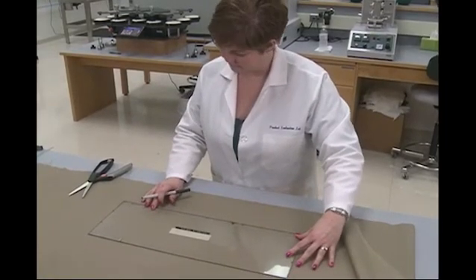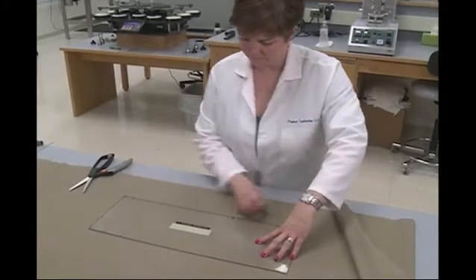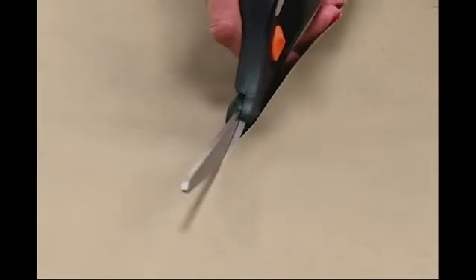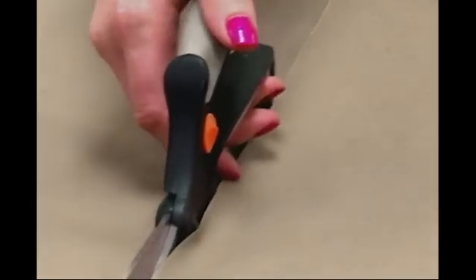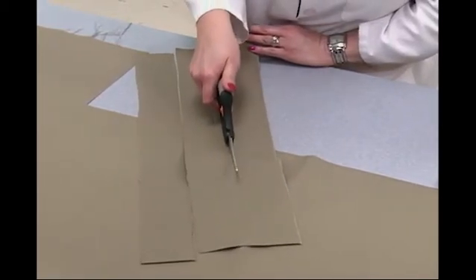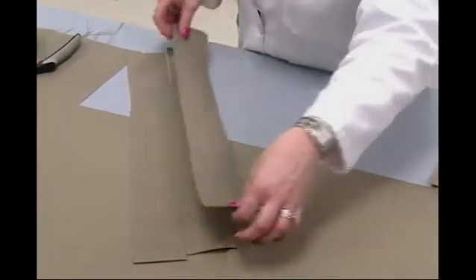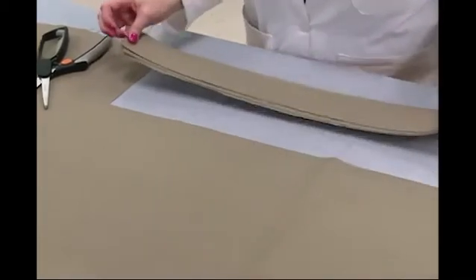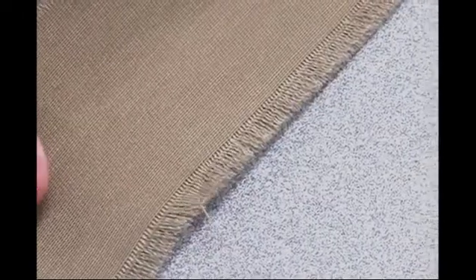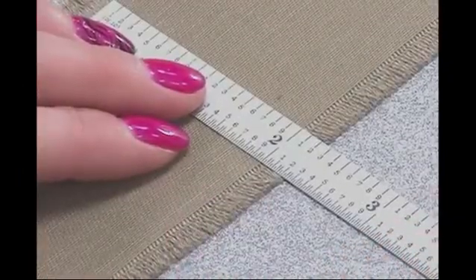3 for stretch and growth after application of a specified tension, and 3 for growth after stretching to a specified extension. Some woven fabrics have stretch yarns in only the warp or length fabric direction. Therefore, only 6 warp direction specimens are needed. If the fabric has stretch yarns in the filling or width direction, 6 additional specimens will need to be prepared. The long direction of a specimen should be parallel to the fabric direction that contains the stretch yarn. Each specimen is then raveled to a 2-inch width, taking approximately the same number of yarns from each side.